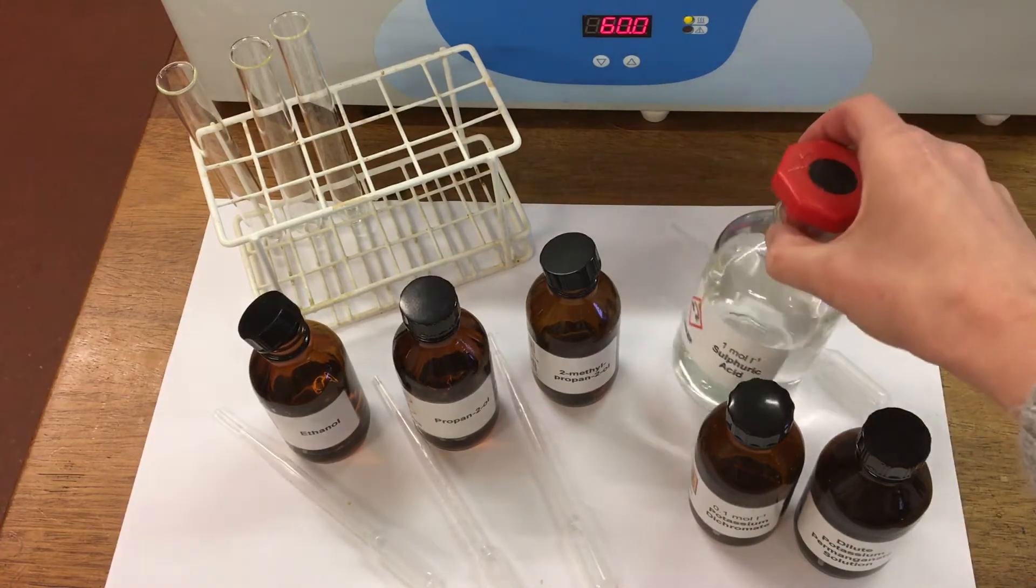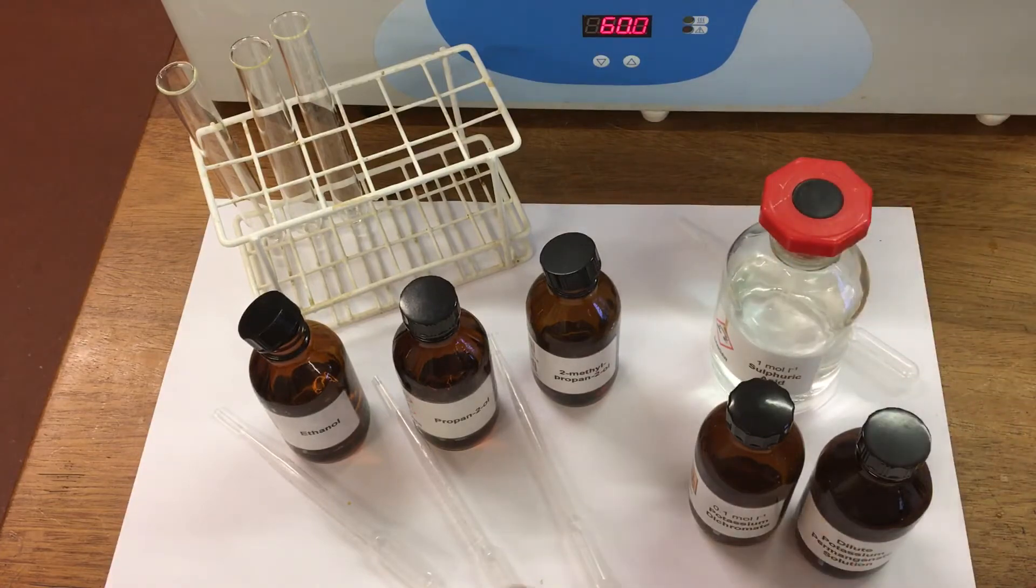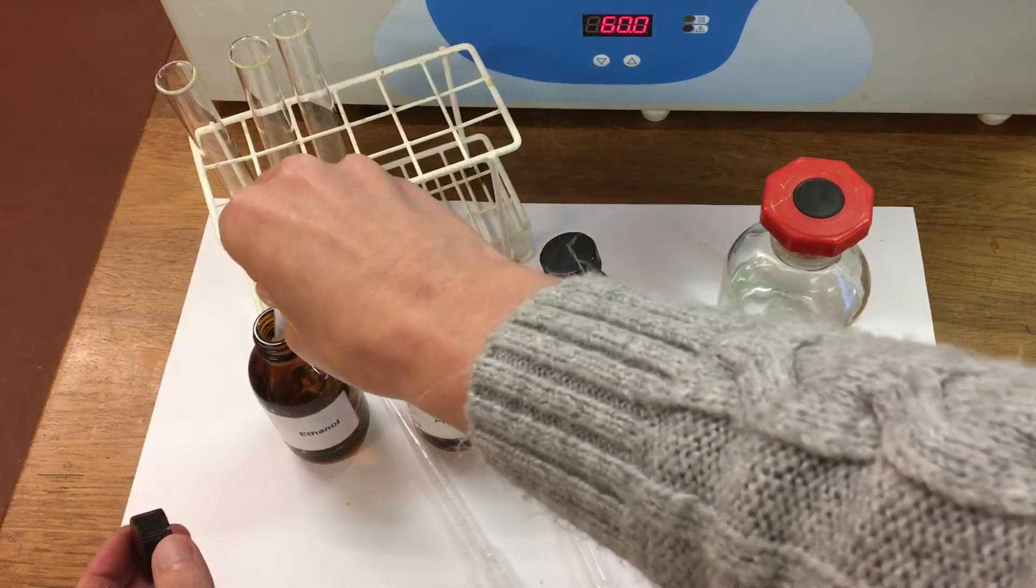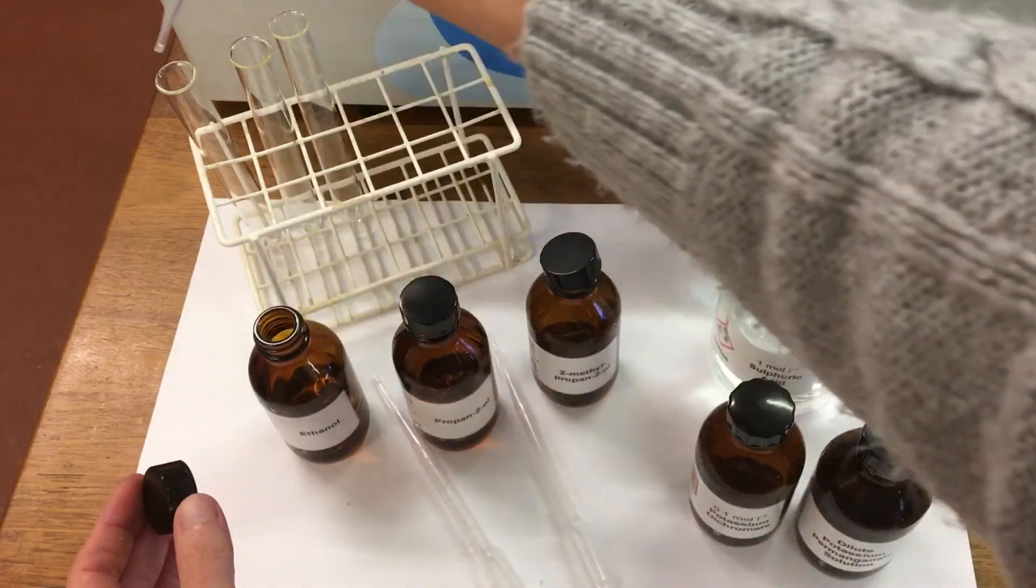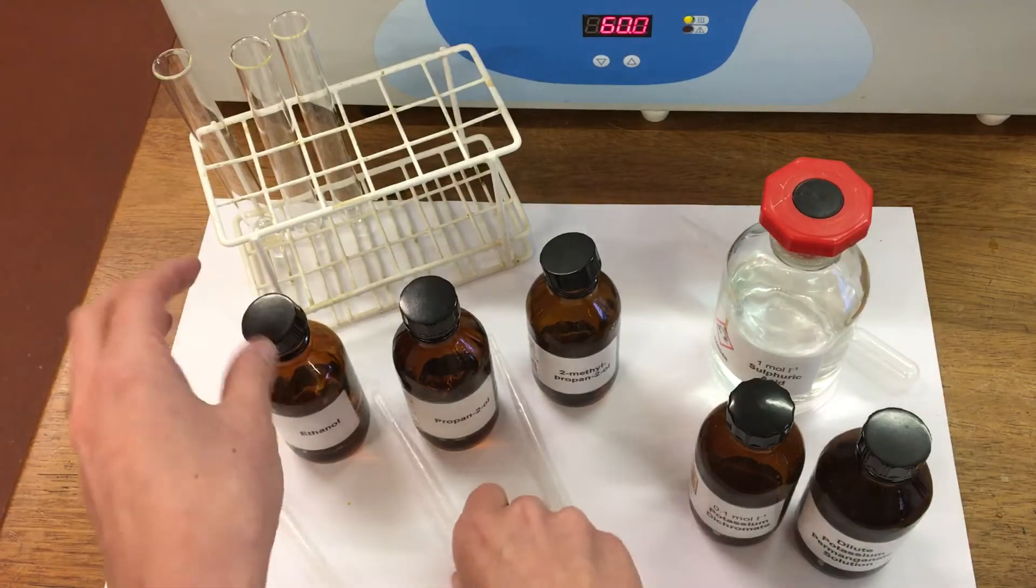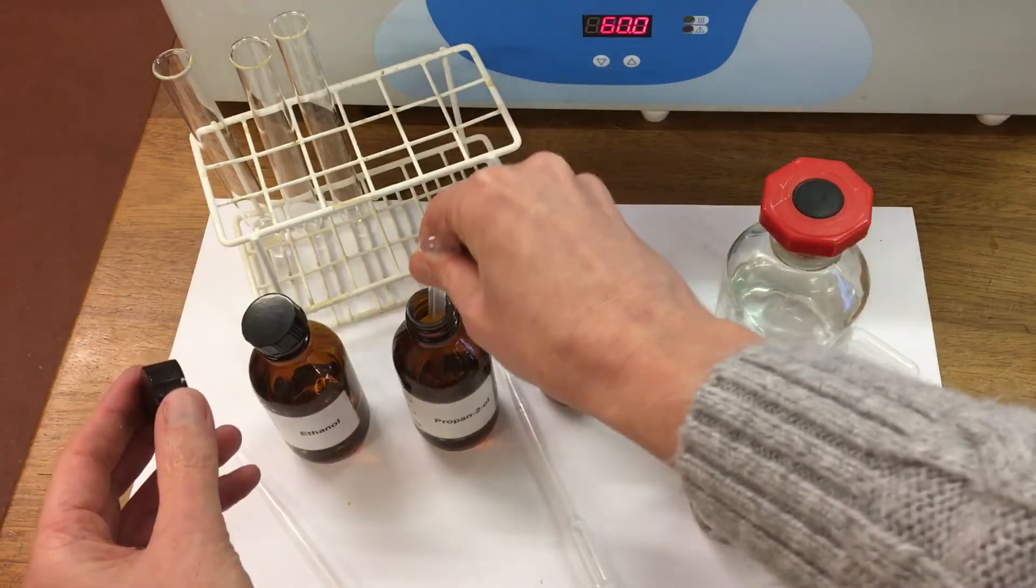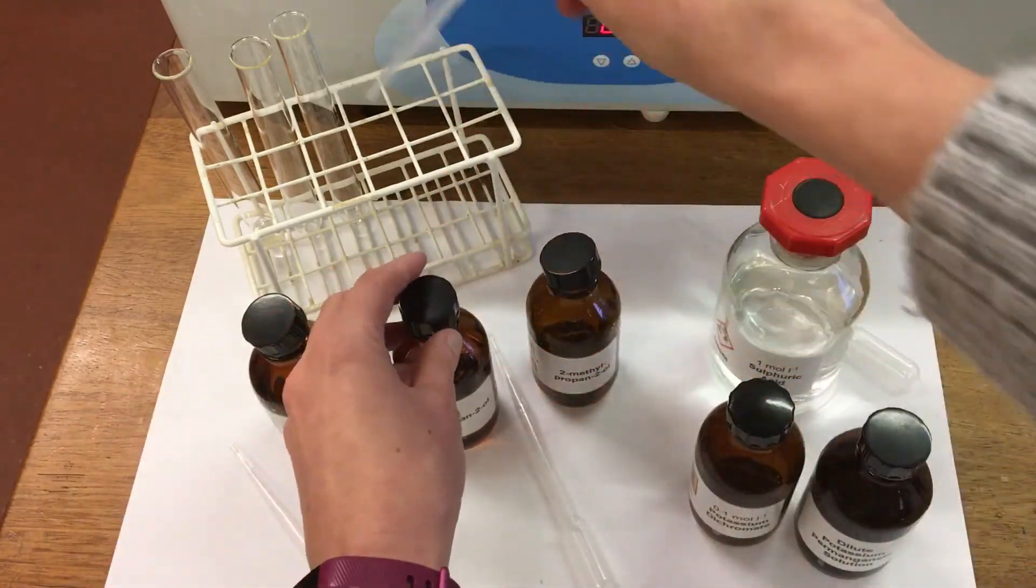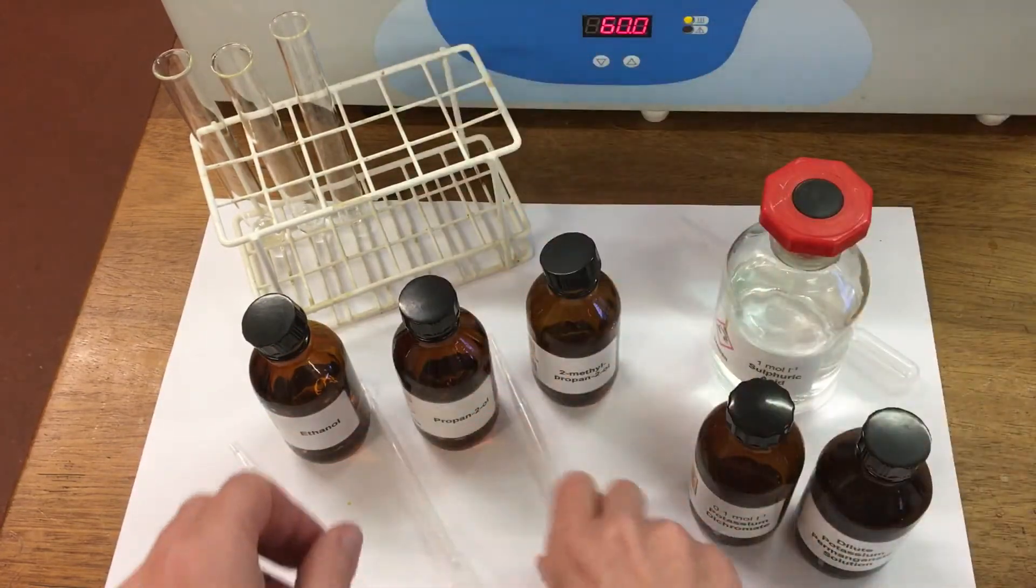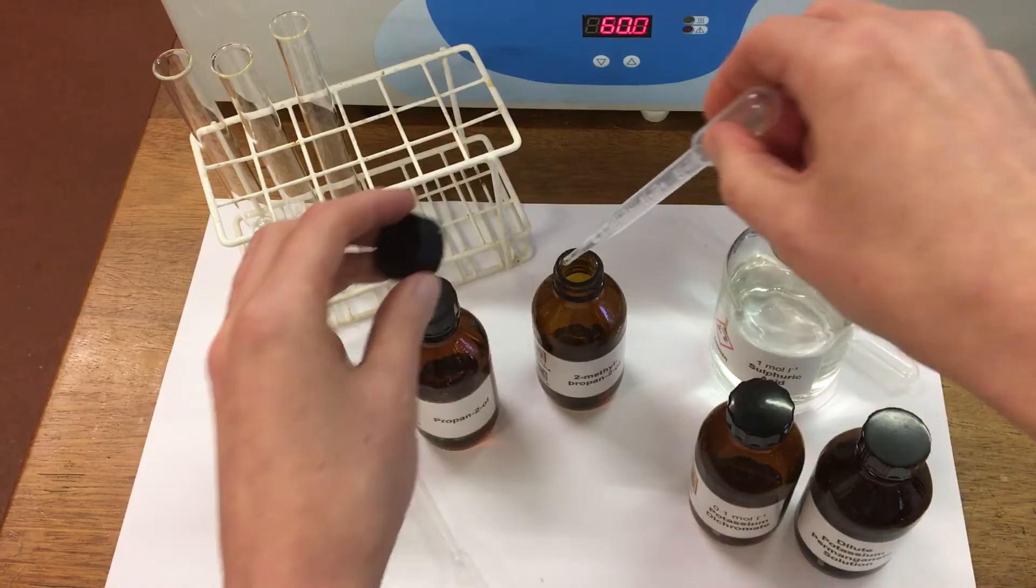So the first step, I'm going to pop a couple of mils of each alcohol into a test tube. So we've got ethanol, propan-2-ol, and 2-methylpropan-2-ol.